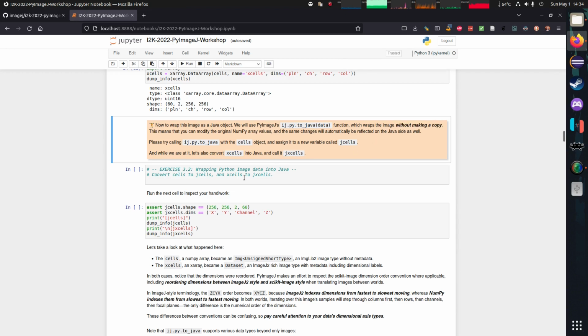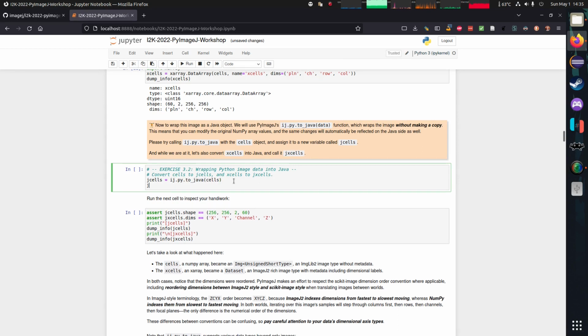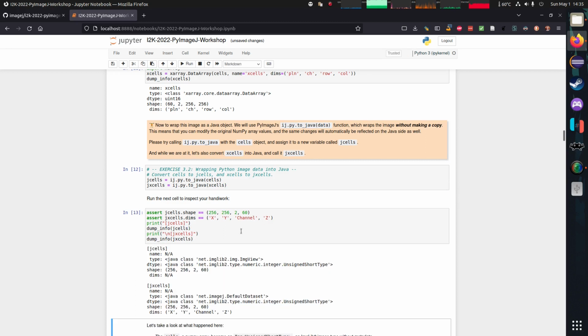Go ahead and pause the video and see if you can create two new variables, jcells and jxcells, which wrap cells and xcells respectively. Okay, we need jcells to wrap cells, and we need jxcells to wrap xcells. Now let's see what we can see.